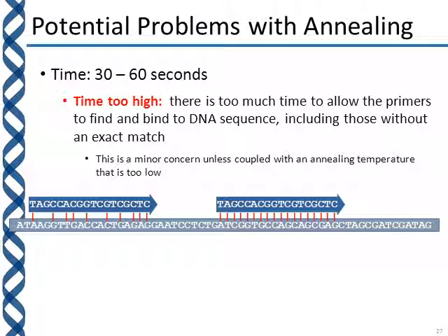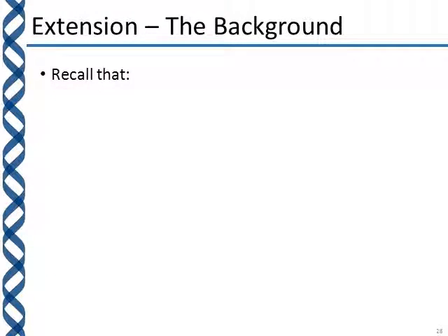However, if we were to do 5 minutes at, say, 30 degrees, then both of these primers would stay bound, one to the correct location and one to the incorrect location, and you would end up with that non-specific amplification.